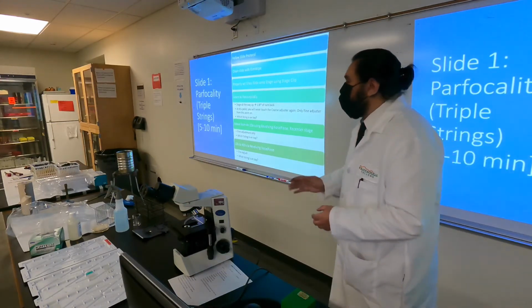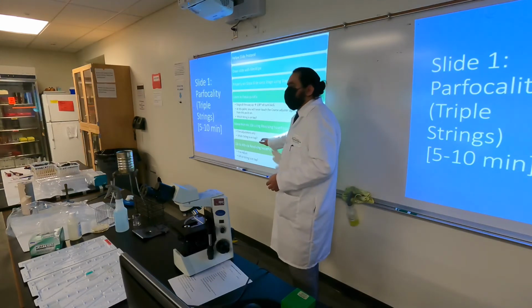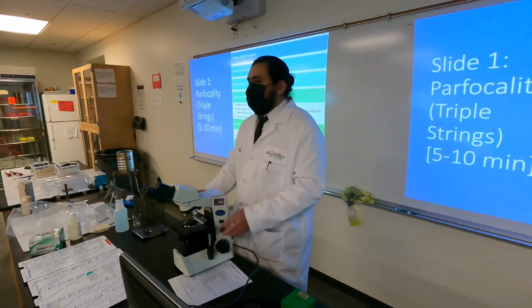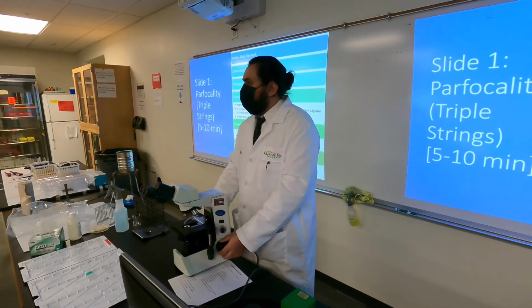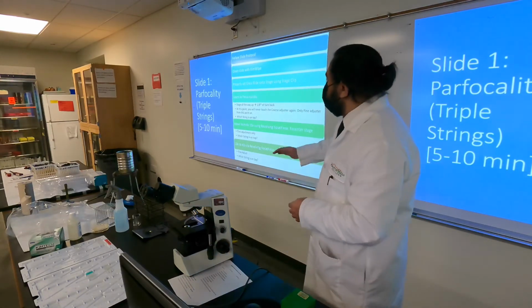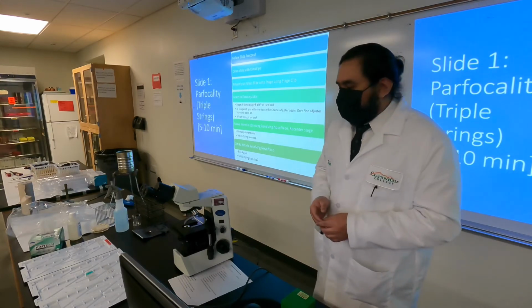Now from that point on, we will not touch the coarse adjuster anymore, only the fine one, the little thin one, the little nubbin that's sticking out. That's the fine adjuster. Why? Because if we use the coarse adjuster any further, we'll raise it and we'll crack the slide and scratch the lenses because they get really close.